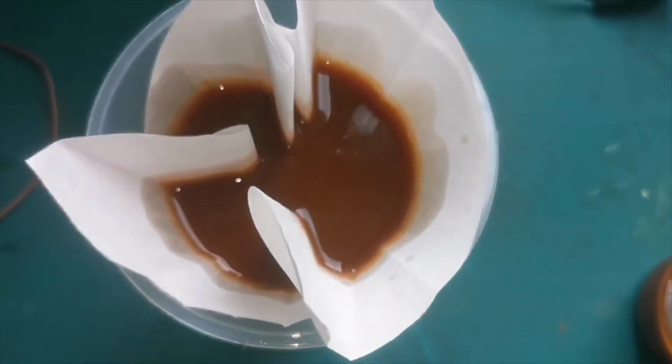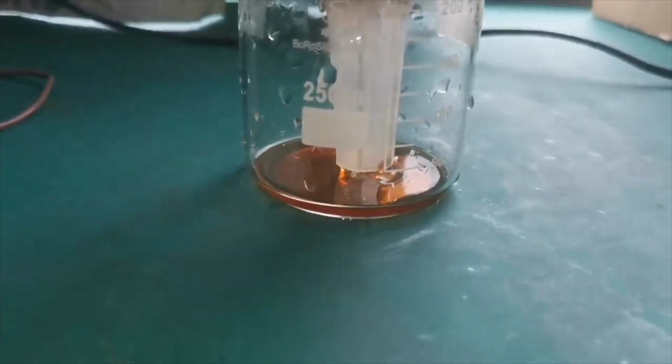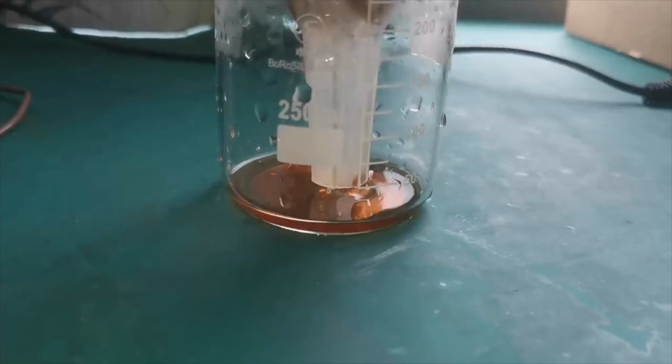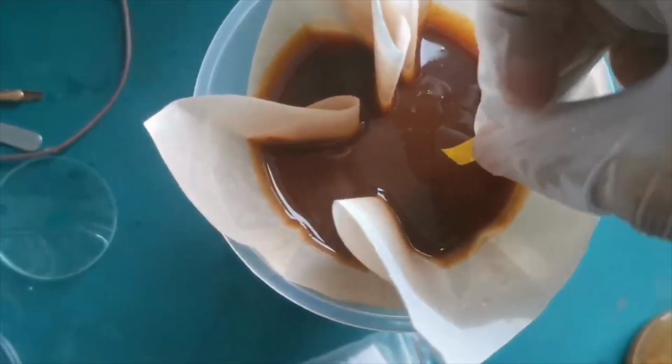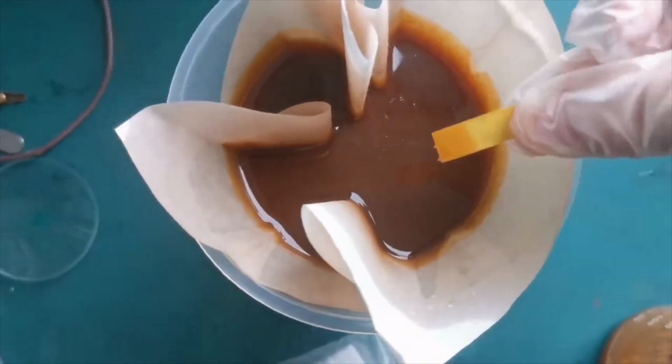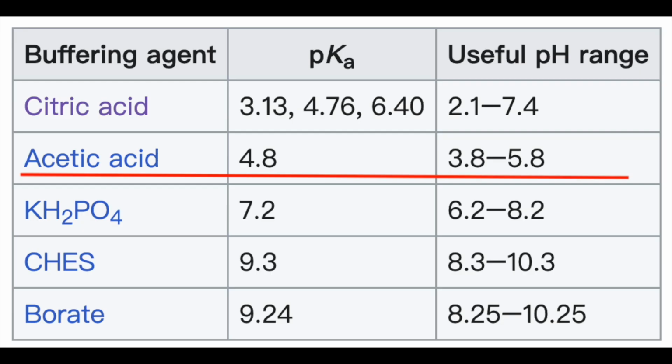A few moments later, the acetate solution boiled, and I filtered it through some filter paper. Unlike the mixture before, the filtrate displayed a beautiful dark red color typical of cobalt ions. I quickly tested the pH of the solution, and it is around 4, which is exactly what I want. A major contaminant in our solution is iron, which exists as iron(III) ions. They start precipitating at a pH of 2, while our cobalt and samarium both precipitate around a pH of 7. The acetate ions in the solution have a buffer effect, which holds the pH of the solution around 4 to conveniently separate the ions.